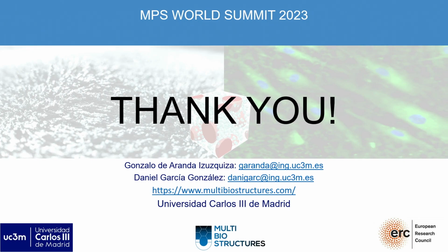Thank you very much, Gonzalo. Are there questions? Then maybe I start by asking, what are you envisioning? What type of readouts with the three-dimensional models you are generating? It's known that forces have a direct impact on cell differentiation, orientation, and things like that. Do you have a specific question in mind?